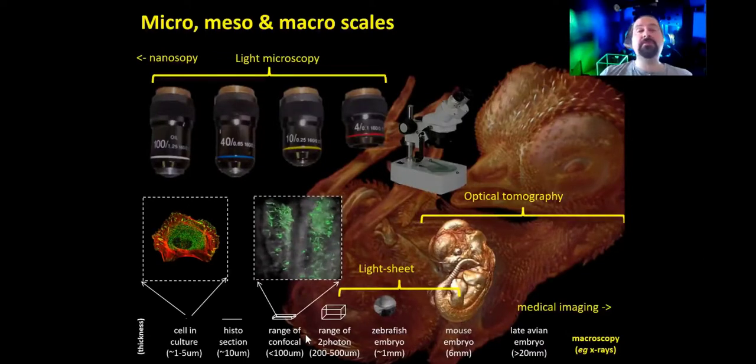Confocal is probably the most common technique that most of you are familiarized with and use on a daily basis. And you know that with confocal microscopy, you can generate three-dimensional images, so to speak. In fact, you don't generate three-dimensional images, but you obtain optical slices of a three-dimensional sample through confocal microscopy. If you're lucky to have a 2-photon setup in your lab, you know that you can actually image deeper, so get a larger chunk of three-dimensional tissue where you can obtain information from.